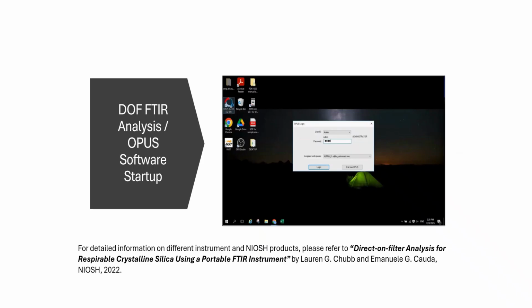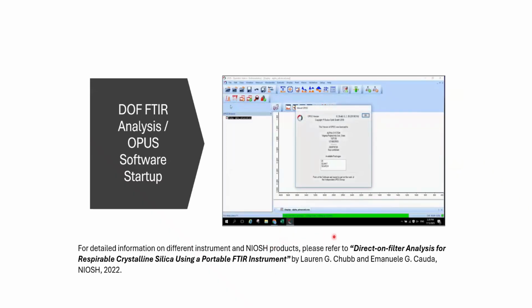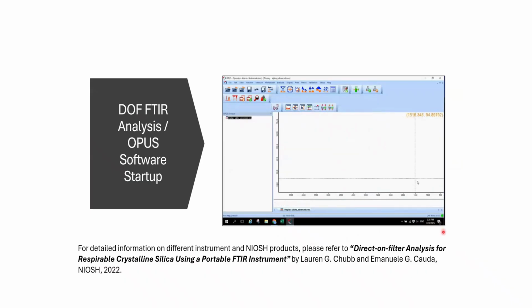So to start, you will open the OPUS software on startup. Some initial tests and diagnostics will run. In the bottom right there will be a circle, and it can be gray, meaning no connection with the instrument; red, meaning internal diagnostics found a crucial error; yellow, meaning a humidity warning or an expired PQ or OQ test; or green, which is good to go.